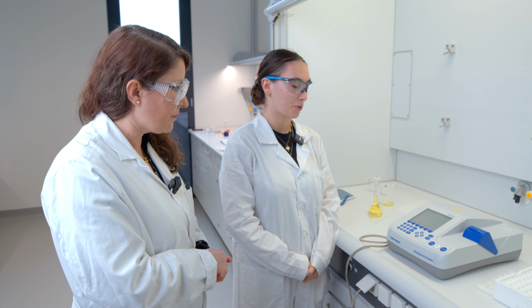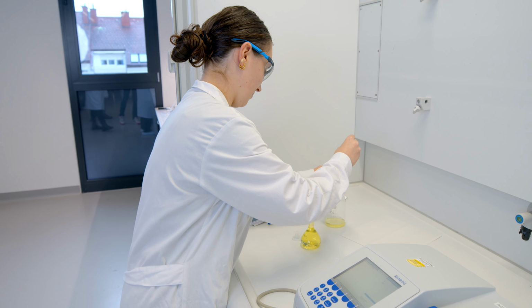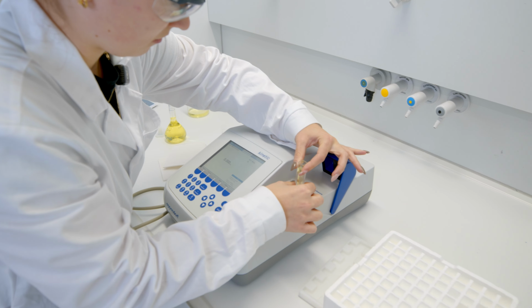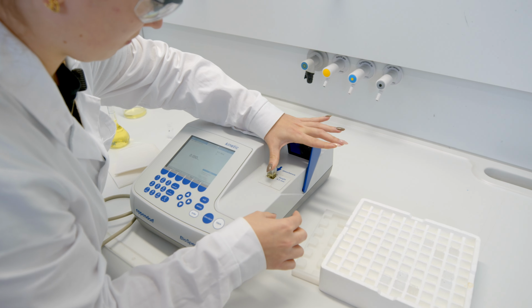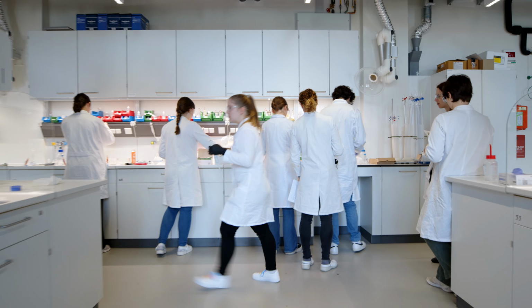Today what we are working on is photometry. We had 3 different dyes that we are measuring, and we are measuring the maximum lambda first, and then the maximum absorbance of the different dyes. We are making 5 dilutions between the absorbance of 100% and 5%, and we are measuring that, and then we're gonna make a calibration spectrum at home, and then based on that we're gonna determine the concentration of the dyes we received today. That was it from here, and now we move to the next laboratories where we have all the instrumental analysis devices, where our colleague is waiting for us.